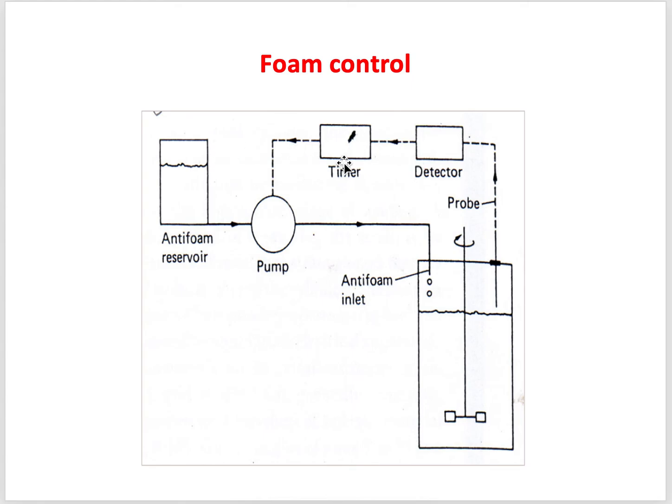Setting the timer is actually important here. Whenever the probe detects foam, you cannot continuously add antifoam into the fermenter, because antifoam is a chemical. After the antifoam is in the fermenter, some time is required for the foam to mix with the antifoam, and then it will work. So the detector system also analyzes this.